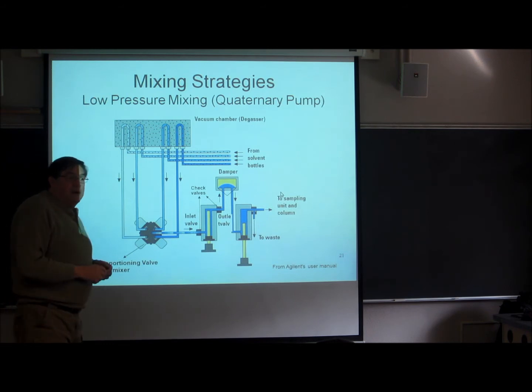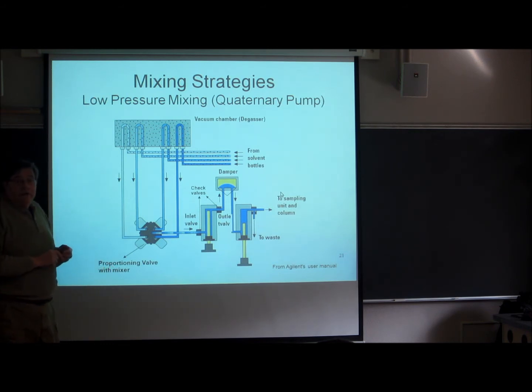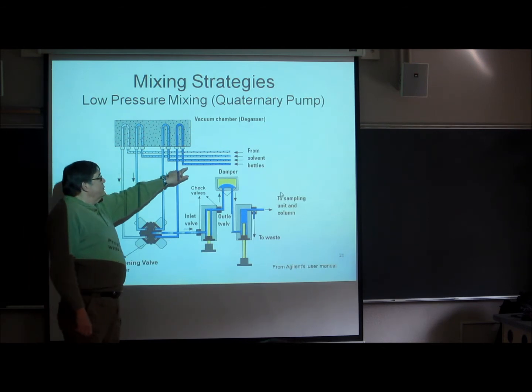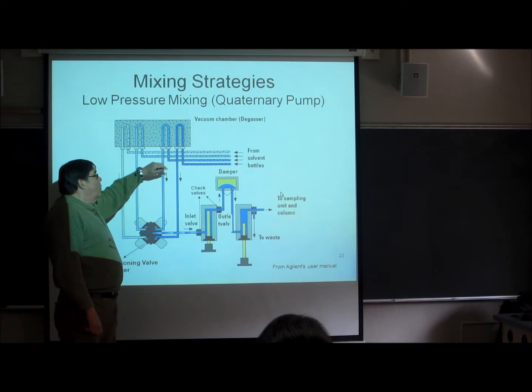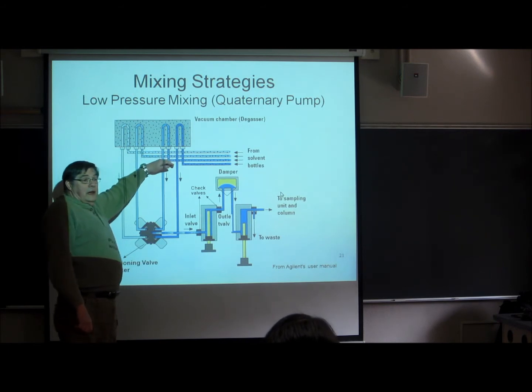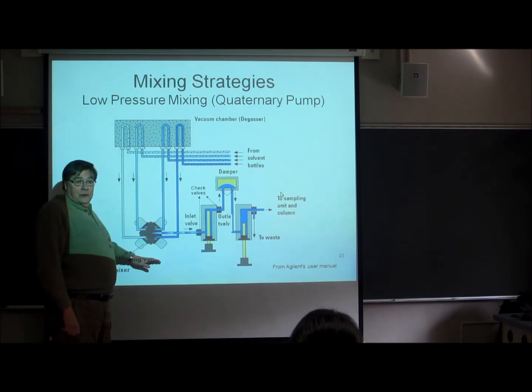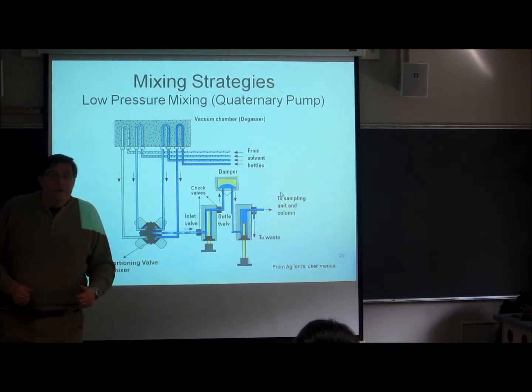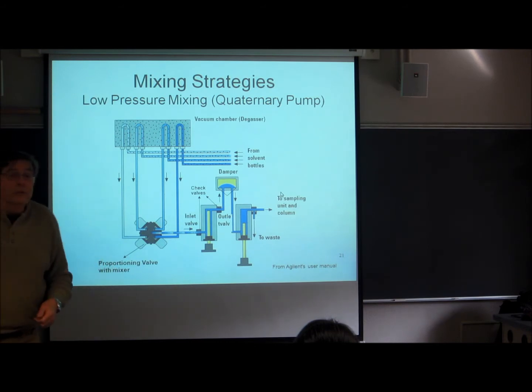I said a little bit about this last time. We have to avoid embolisms, and what can happen here is that you can mix 2 different solvents together, for example, methanol or acetonitrile and water, and if the organic material has a lot of air in it, the water will cause the air to evacuate and form bubbles.